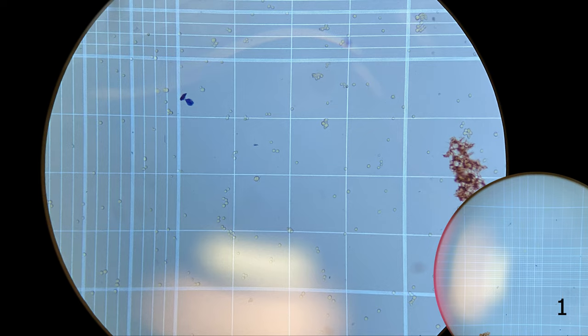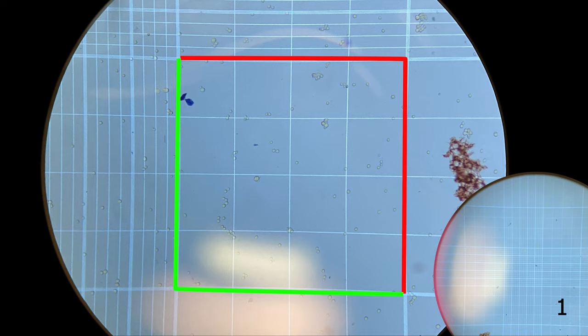One problem you'll have here is that if cells are on the outer edge of your P-square, do you count them or do you not count them? What we do is you pick two sides. In my lab, we do not count cells that are touching the top edge or the right edge. We do count cells that are touching the bottom edge and the left edge. In the end, it doesn't matter as long as you're consistent when counting your cells. So pick two sides. If the cell is touching that edge and it's a side you're not going to count, don't count it. If it's touching the edge that you are going to count, please do count it.